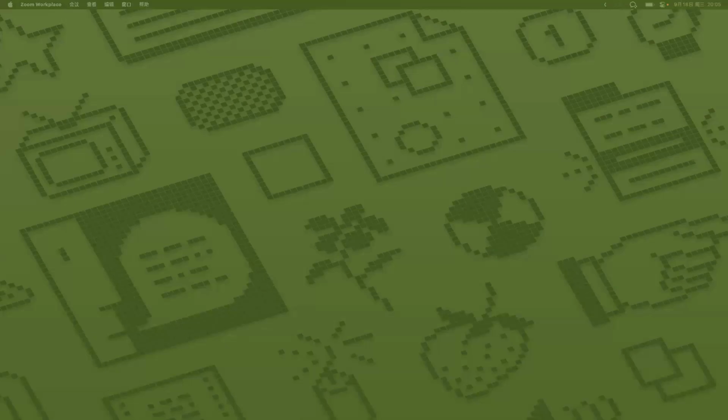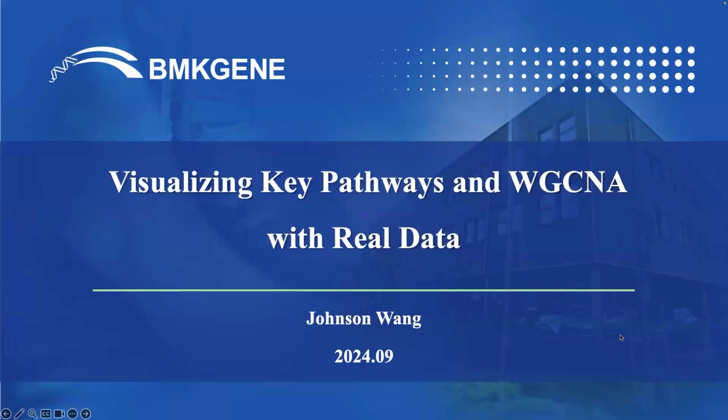Today, we will explore visualizing key pathways and WGCNA analysis with real data. Our webinar today will last for about 30 minutes, followed by a dedicated 5 minutes for your questions and answers. You can freely submit your questions by using the Q&A button at the bottom of your screen.